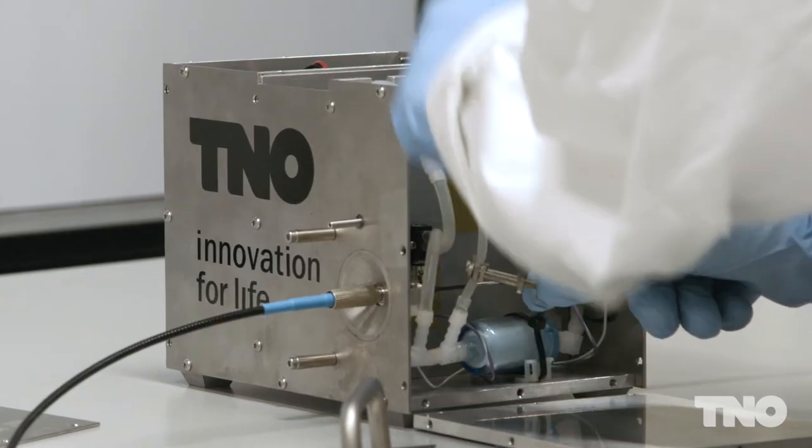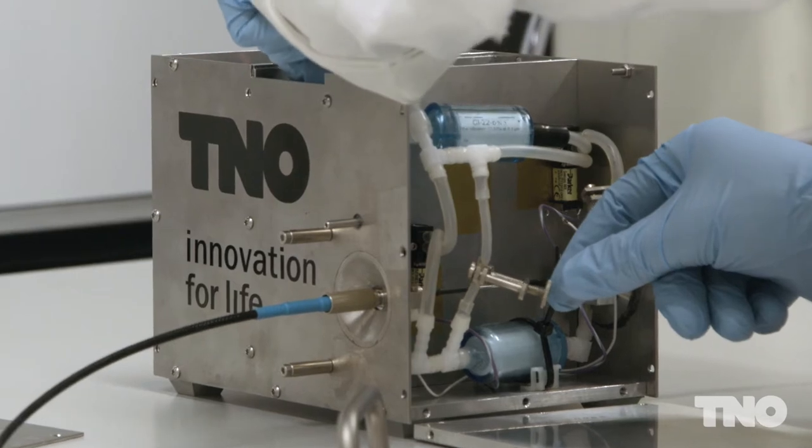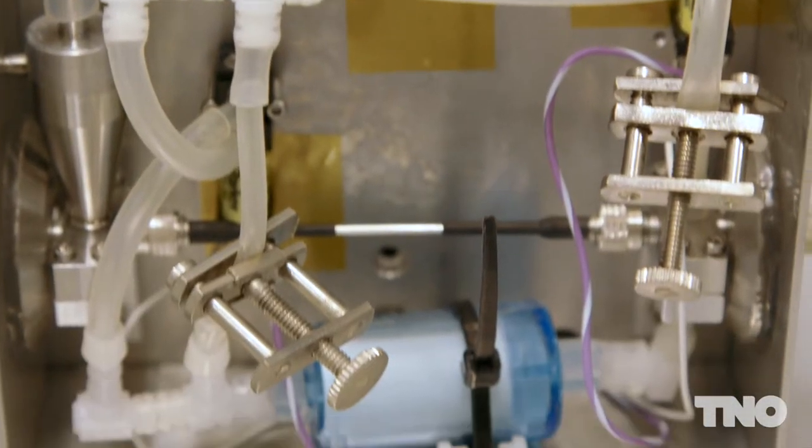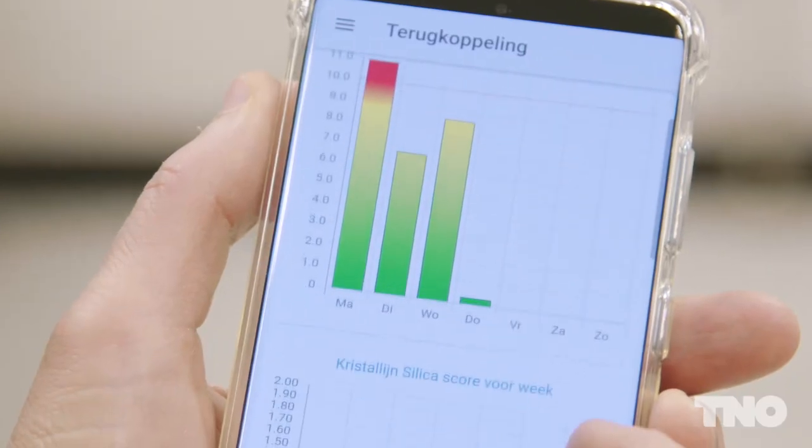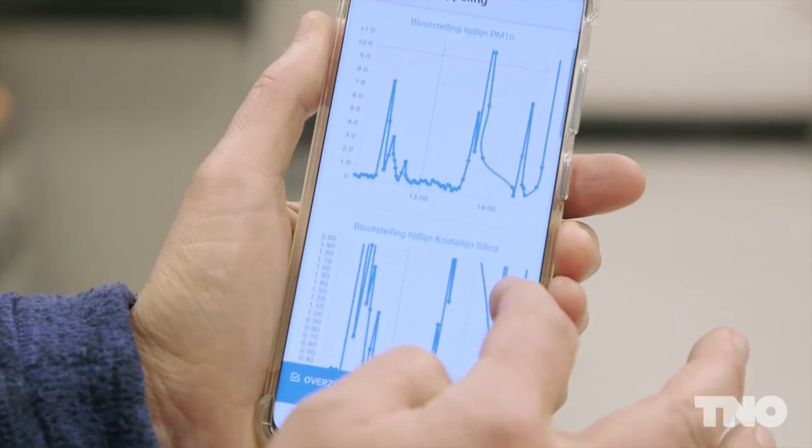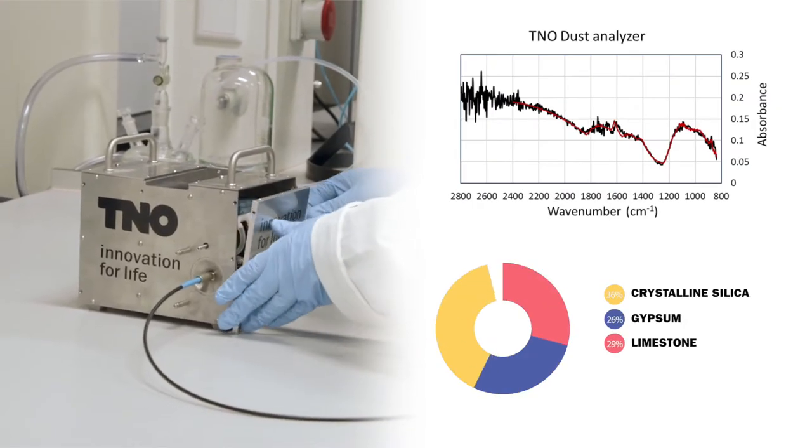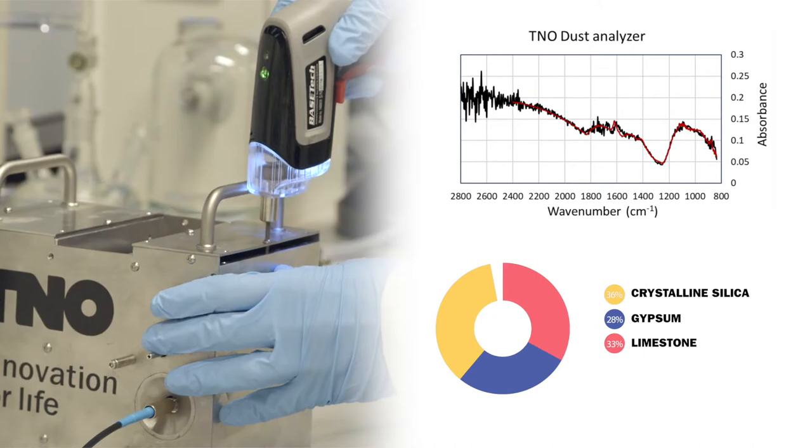Knowing the exact composition in real time offers better possibilities to protect workers. That's why TNO developed a portable device that uses optical spectroscopy to identify dust composition, in this specific case crystalline silica content. The device can measure dust composition in near real time.